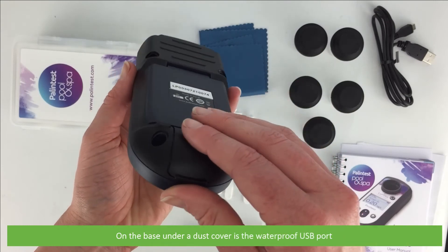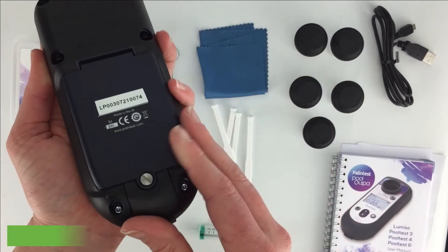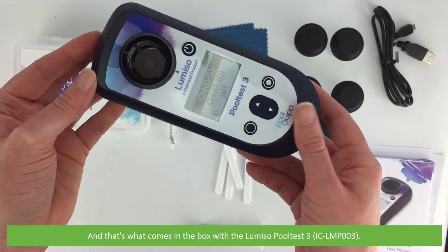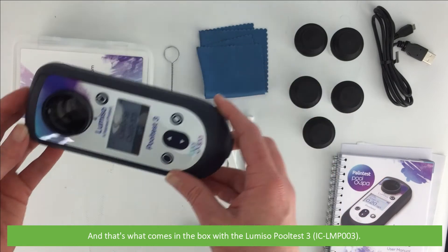On the base, under a dust cover, is the waterproof USB port, and on the back is the battery compartment. And that's what comes in the box with the Lomsio Pool Test 3, the IC LMP003.